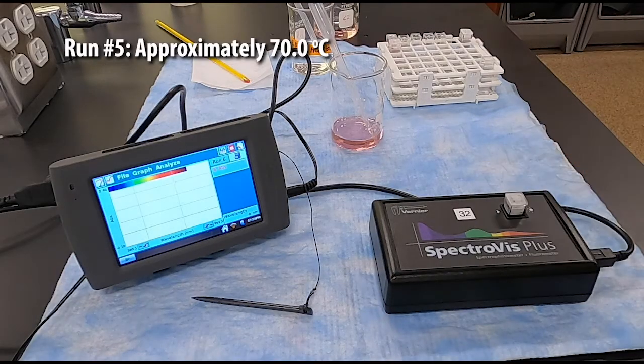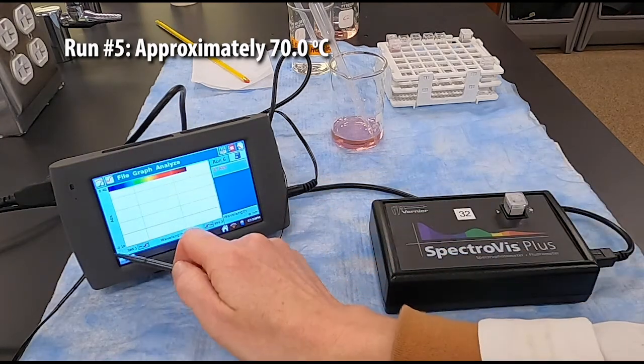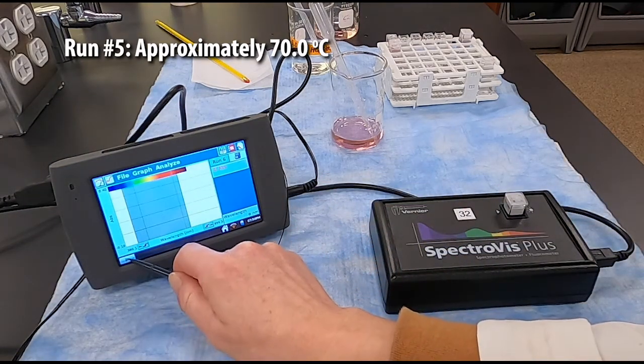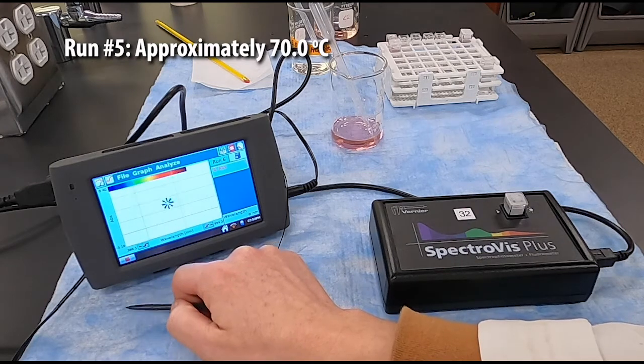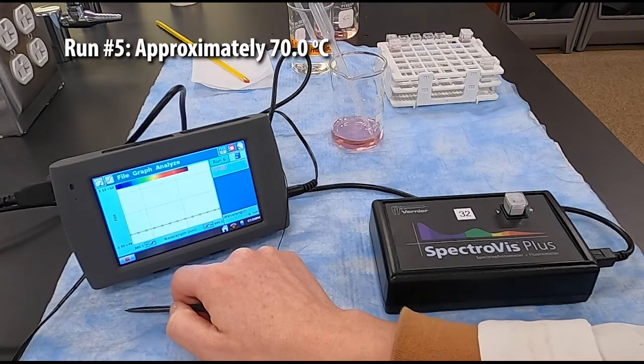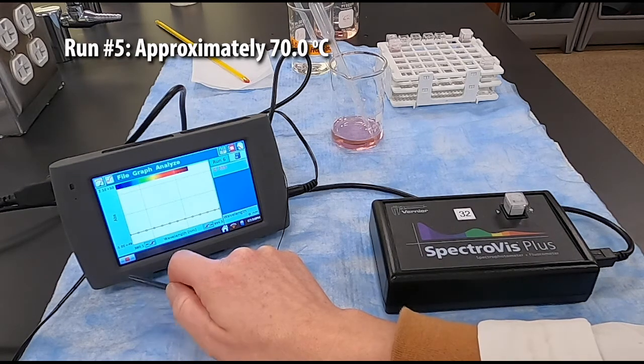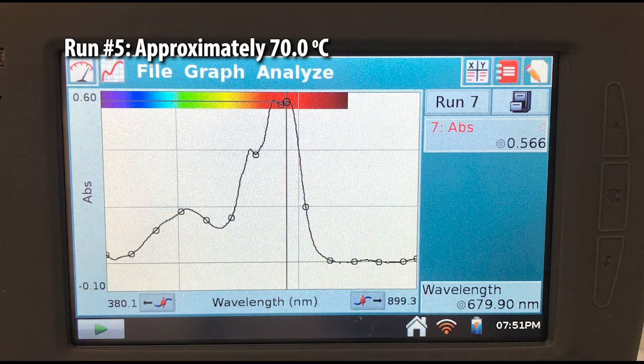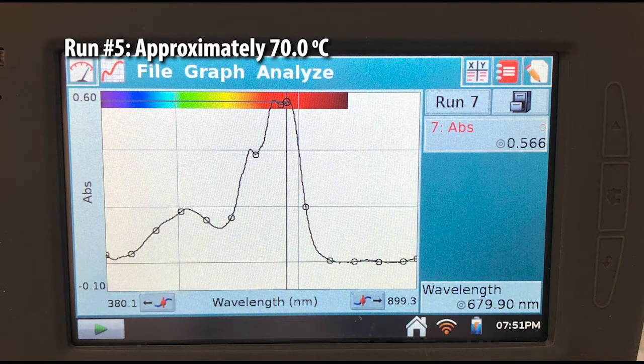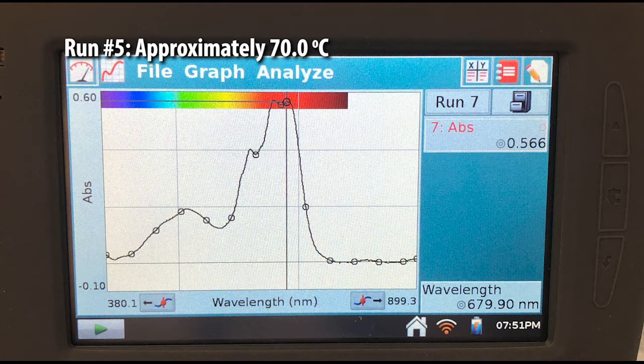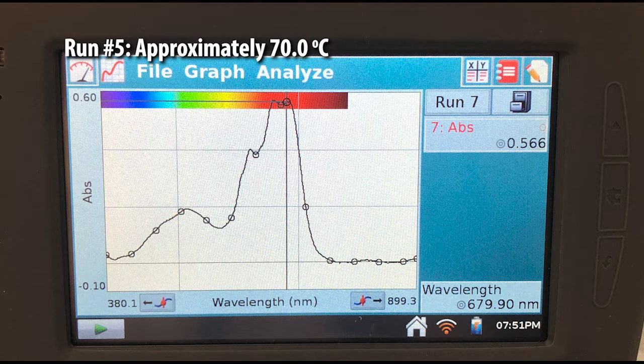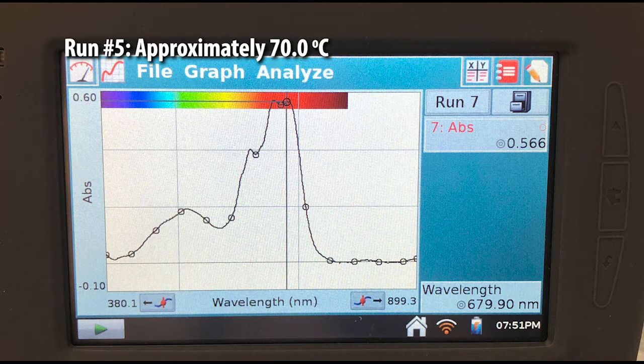While we're waiting for the spectrum of this last sample, let's recap what data you should have collected in your lab notebook. For each of the five runs, you should have the temperature in Celsius and the absorbance of that second product peak written down. You should have the lambda max of that product peak and also the mass of the empty beaker and the beaker plus the solid so that you can calculate how much cobalt-2 chloride we used. Don't forget that you'll also need the concentration of the hydrochloric acid stock solution to finish your calculations.